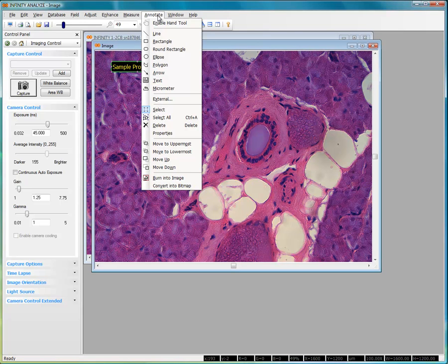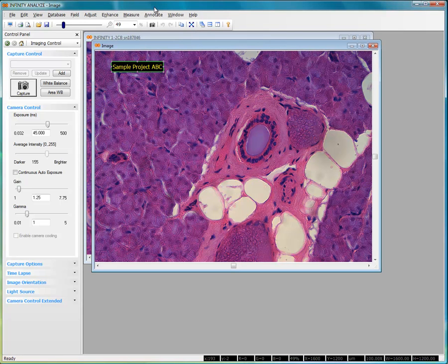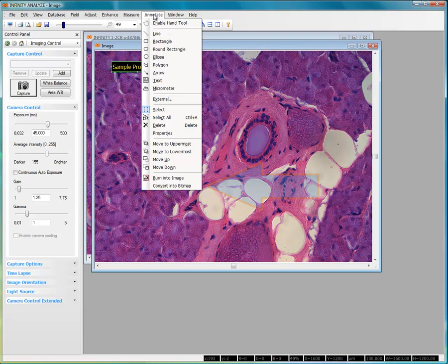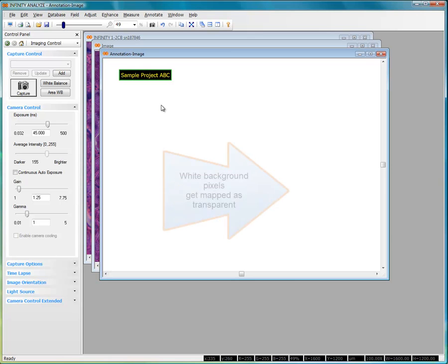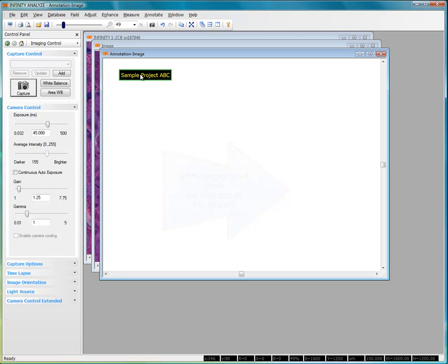Once you've placed the desired annotation on your image, then you can choose from the annotation menu, Convert into Bitmap. You'll notice that an empty appearing image has been generated. This is essentially a blank bitmap file, or a bitmap file where all the pixels have been set to pure white, with the exception of the overlay text that I had entered.